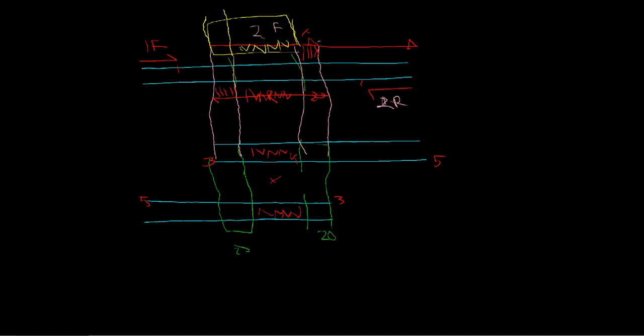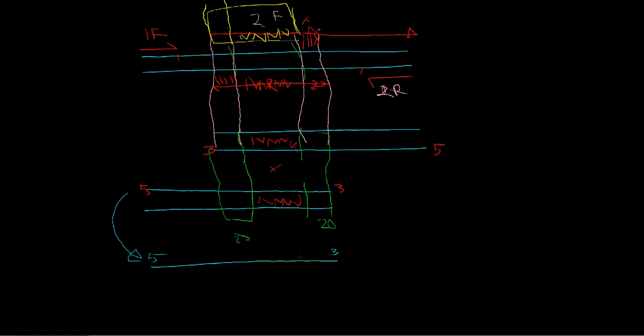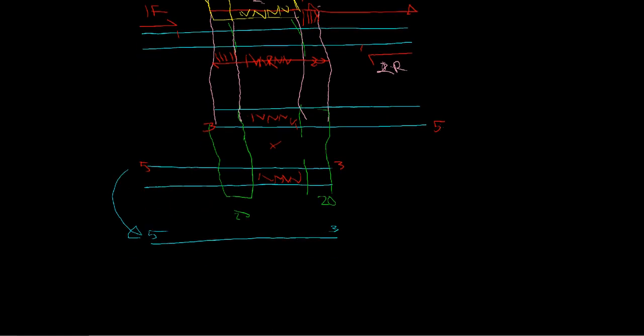And we're going to redraw these so that during the denaturing step, this DNA strand right here, its 5' and 3', is going to melt, and then our other strand up here is also going to melt. We have our 3' and our 5'.